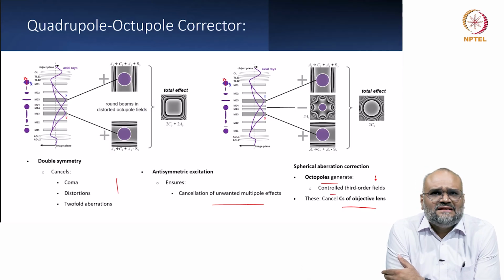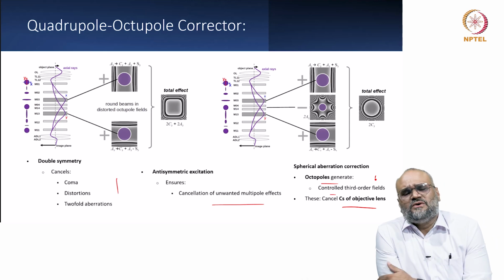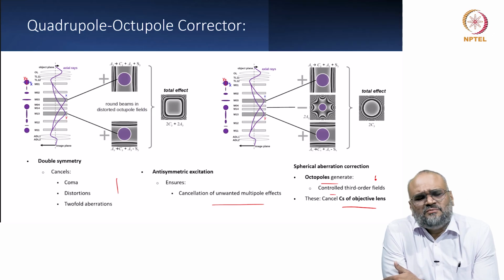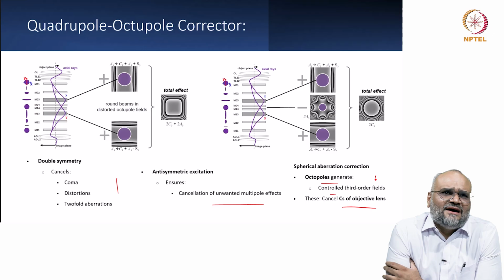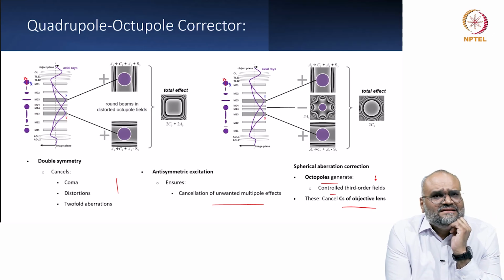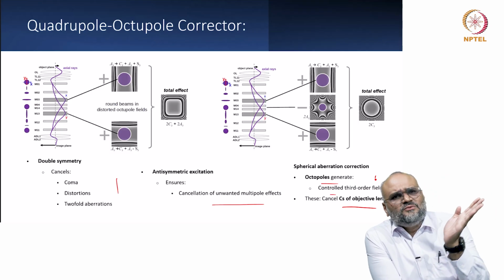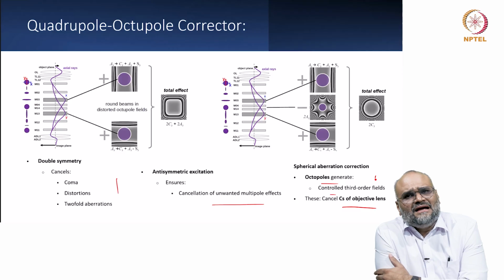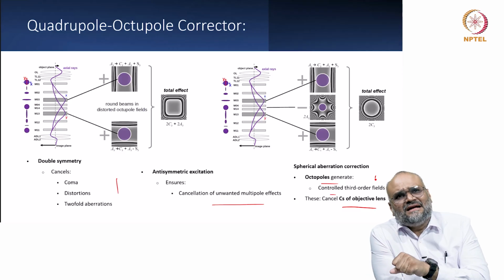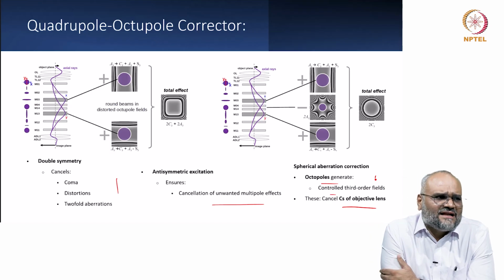So, what happens is, if one of the quadrupoles is replaced with the electric component, for any small distortion in the incoming electron wavefront, if there is any gradient in the energy, the faster moving electrons bend more inward and the slower moving electrons bend more outward, and you are now compensating for the chromatic spread, and with this kind of a construction you can also have chromatic aberration correction as well.